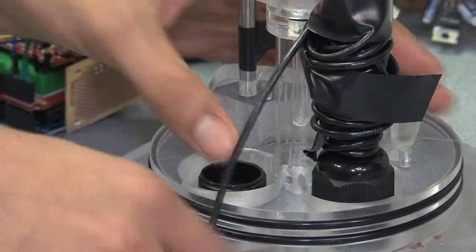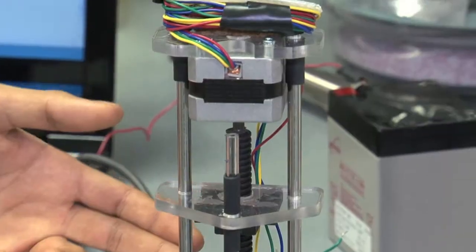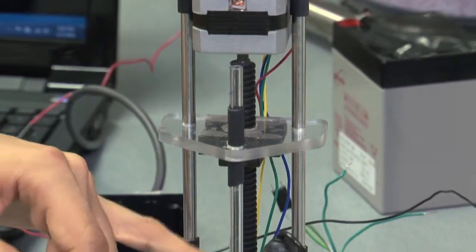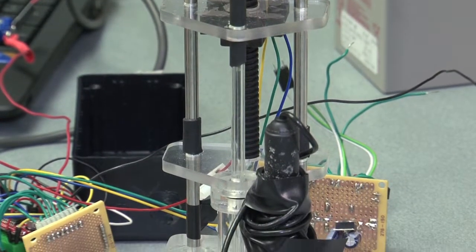which in turn gets attached to the working electrode. As the stepper motor spins, the electrode is pushed into the sediment, and so a depth profile can be taken.